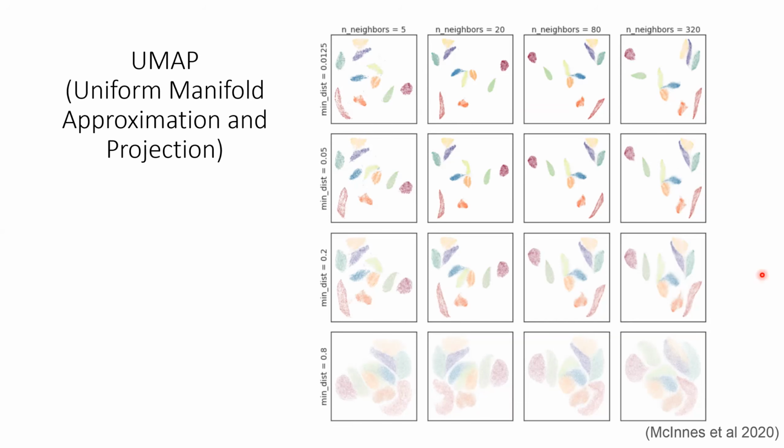Okay. So another way you can change what the UMAP looks like is by titrating the minimum distance that's used in the UMAP algorithm. Across the rows in this graph here, we're titrating the minimum distance, which is a parameter used in manifold approximation. It's used to decide whether or not cells are close enough in gene expression space to be neighbors. And you can see how this gives slightly different visualizations, but overall the pattern's kind of similar.